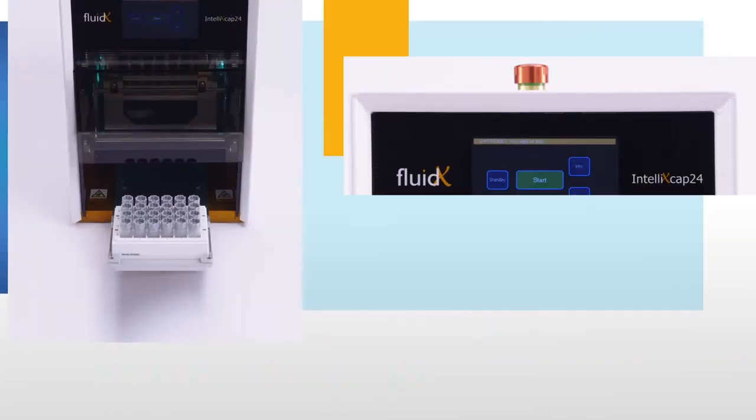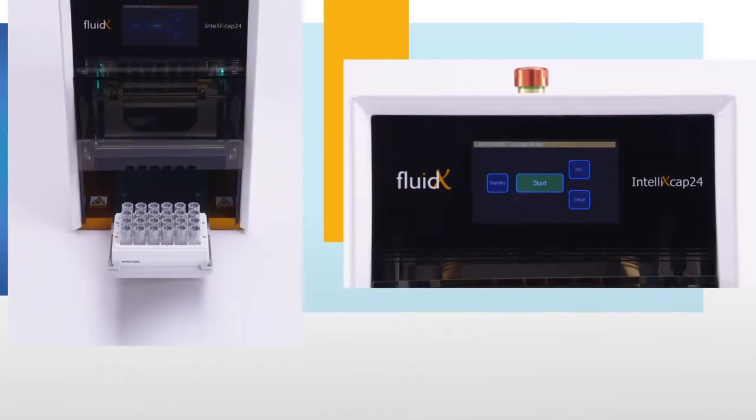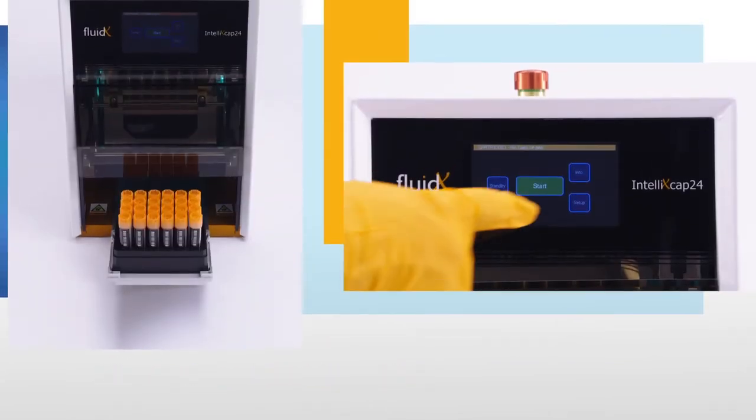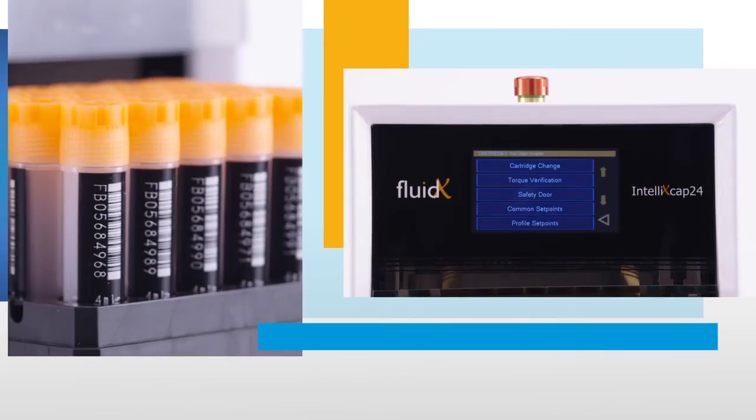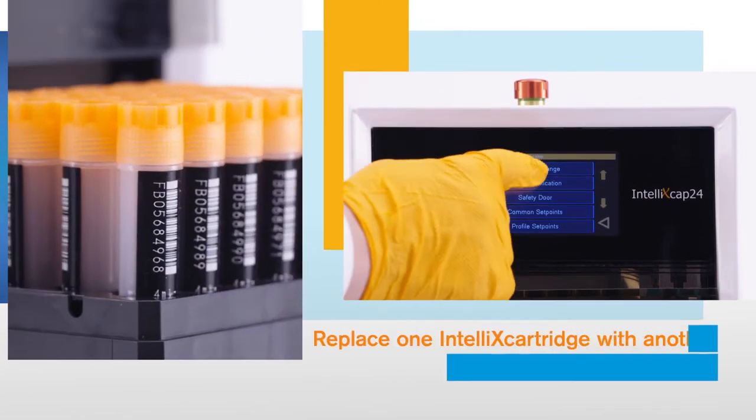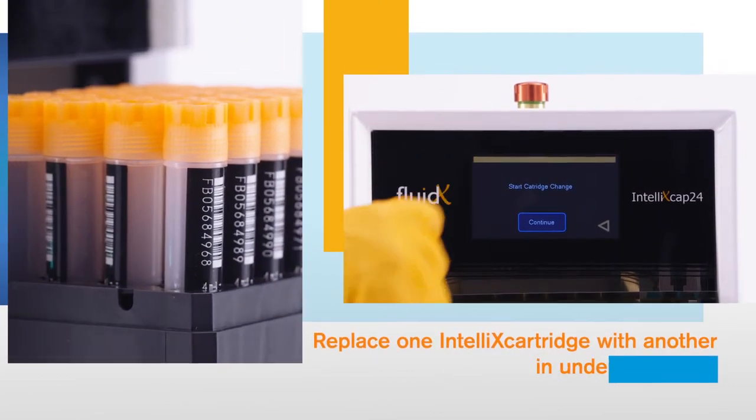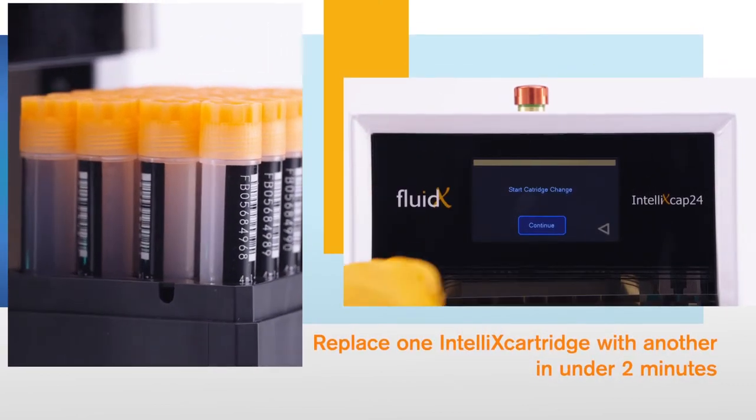And switching between tube types couldn't be simpler. Using the touch panel, you can replace one Intelli X cartridge with another in under 2 minutes.